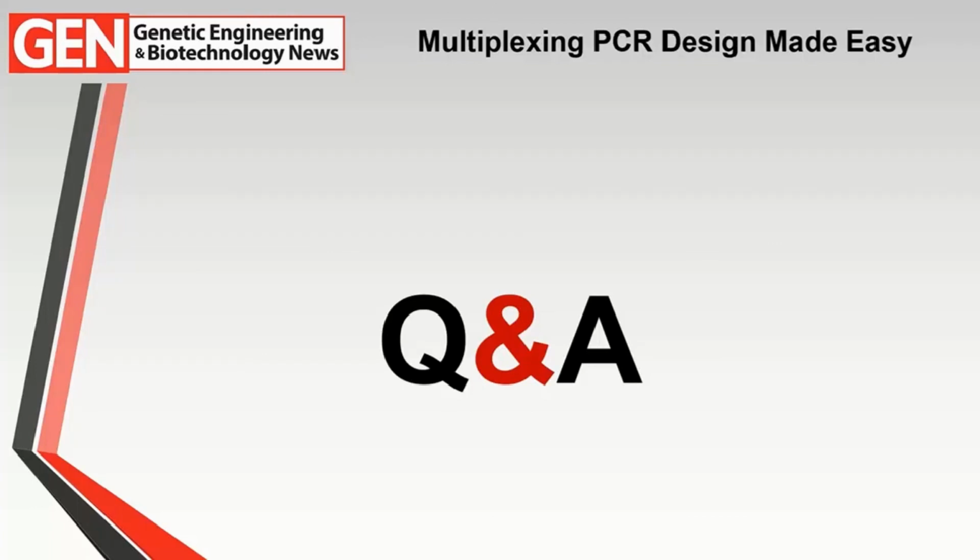I'll follow up on that. The empirical multiplexing approach, even with the limited bioinformatics approaches that many companies take, often leads to that whack-a-mole situation that I discussed in my part of the webinar, where folks get into this loop of design and redesign and reoptimization, without knowing what's going on and not really taking into account the system effects. That's really the essence of what we've spent a lot of time figuring out. All of the causes that make multiplexing not work, wherein primers cross-hybridize or primers form false amplicons with the background DNA, are not something that typical users have the expertise on hand to address with proper software ahead of time.